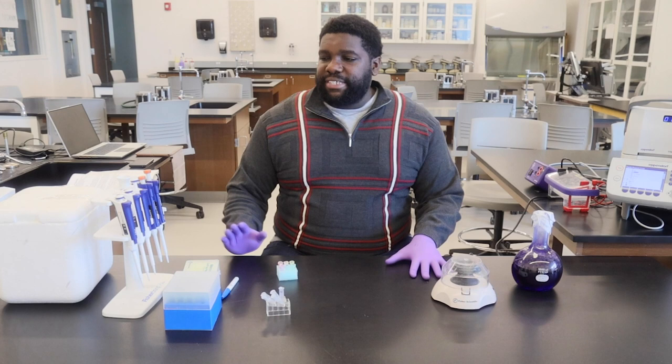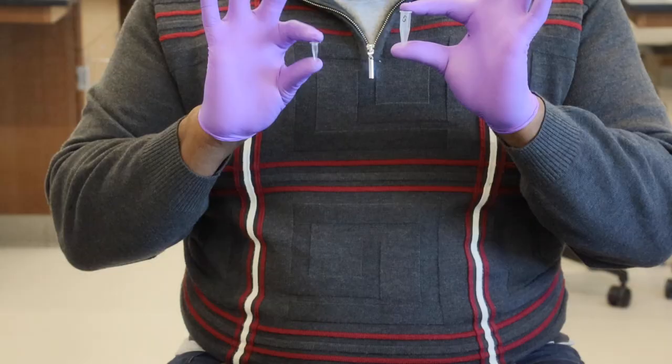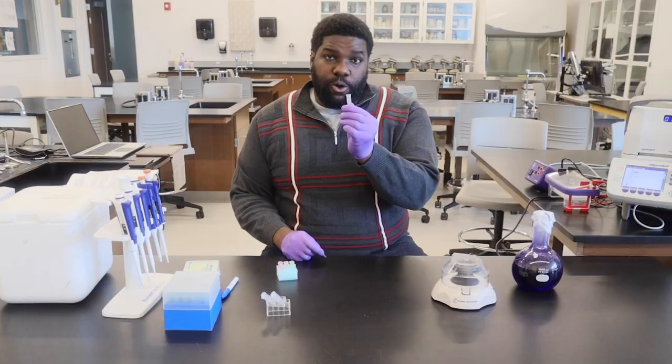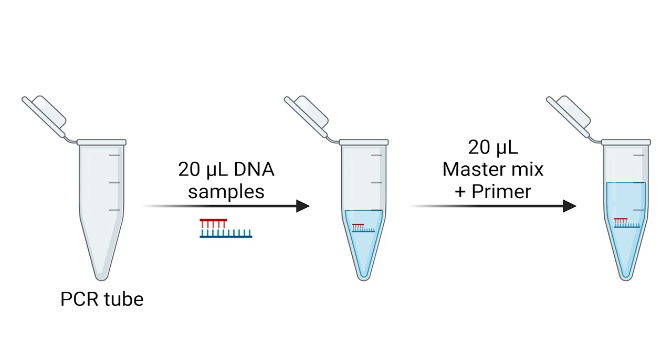For today's experiment, we will be using micropipettes, micropipette tips, and two different Eppendorf tubes. One is tiny for our PCR materials. The other is to hold our PCR mix, and we'll be combining master mix plus primer with our DNA samples to do the PCR reaction. We're also going to use a microcentrifuge along with our thermocycler.